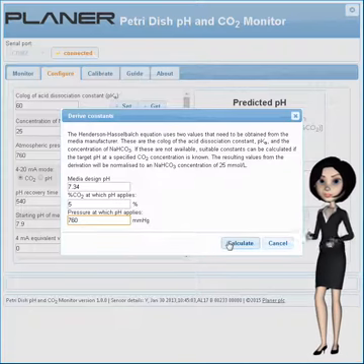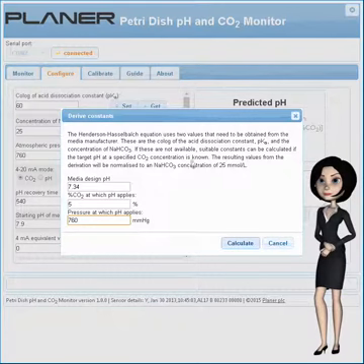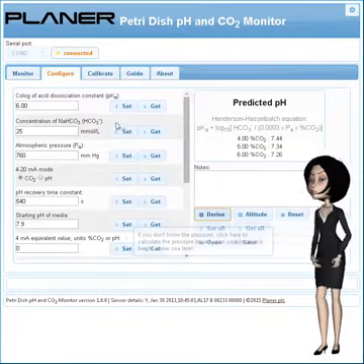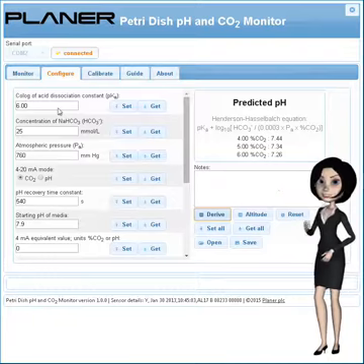Then click Calculate, and suitable coefficients will have been automatically calculated.